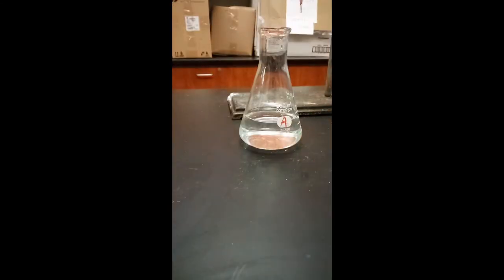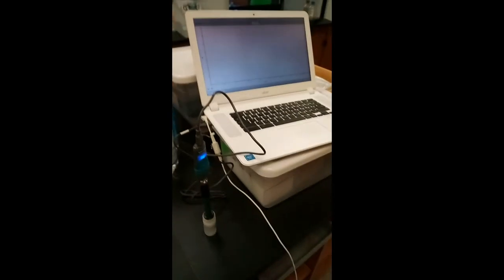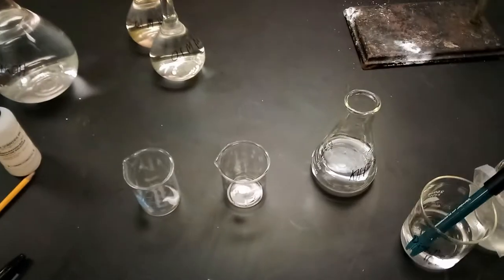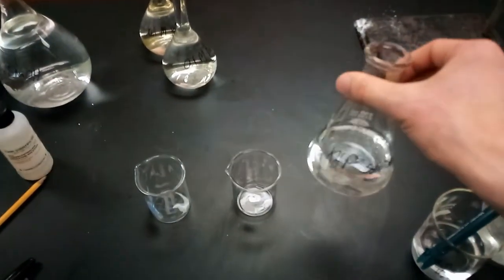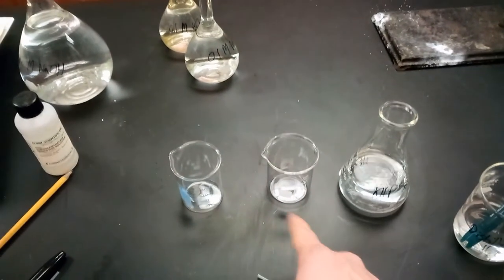Once your solution is made, what you want to do is get a pH probe properly hooked up to your computer like it is here. Then we'll be taking our KHP solution here and we'll be adding 25 milliliters or so into each one of these two beakers.